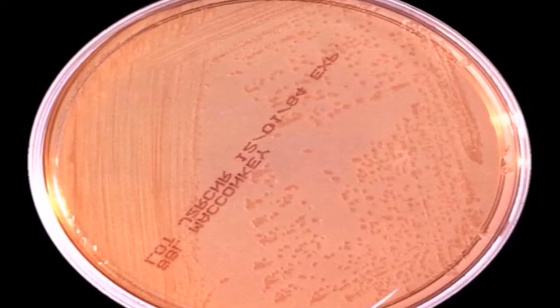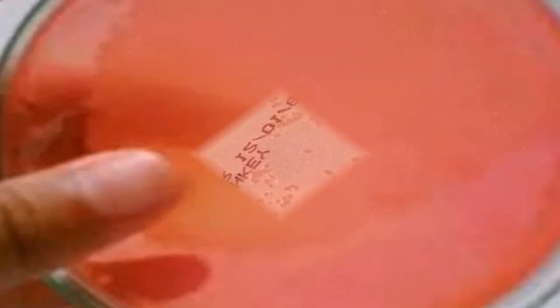All of our samples taken from the door handles on the outside of the bathroom showed a 1 for growth, except for 2 doors. Except for 2, none of our samples taken from the door handles on the inside of the bathrooms leading out of the hall showed growth. In reality, at least a couple of these black sheep were probably contamination. However, if we ignore this fact, we can still make a few conclusions about what grew on our plates.